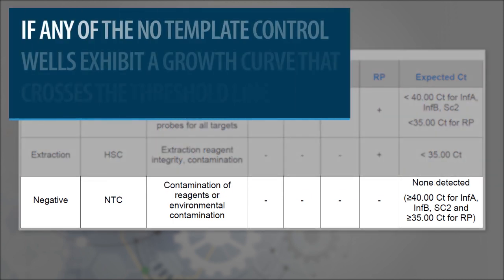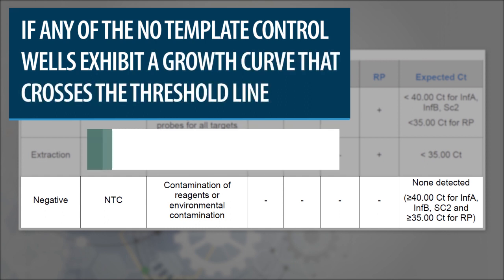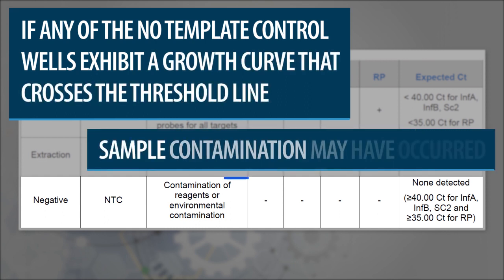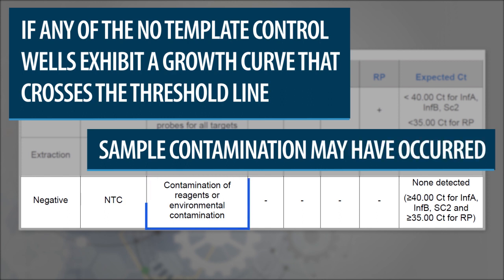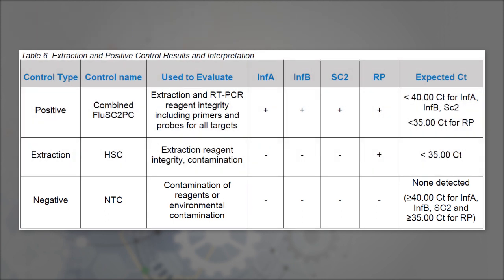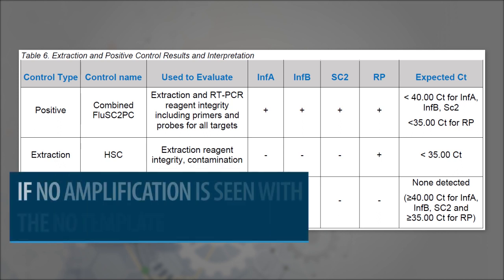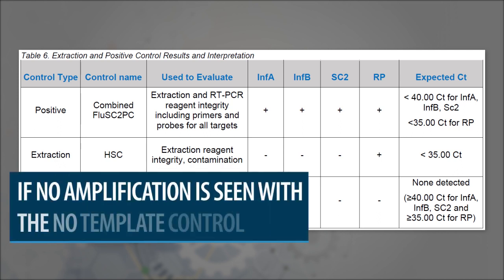The No-Template Control wells should not exhibit fluorescent growth curves that cross the threshold line. If any of the No-Template Control wells exhibit a growth curve that crosses the threshold line, sample contamination may have occurred. Invalidate the run and repeat the assay with strict adherence to the guidelines.